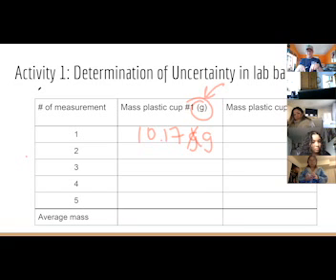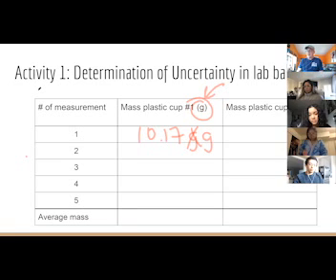So why do you think, now my number is like 10.20. Why do you think the numbers are changing? What's going on with the number changing like that? What could change the mass? Dust. Air? Air, exactly. Just breathe in it. Just go. What happens? Changes pretty dramatically, right?